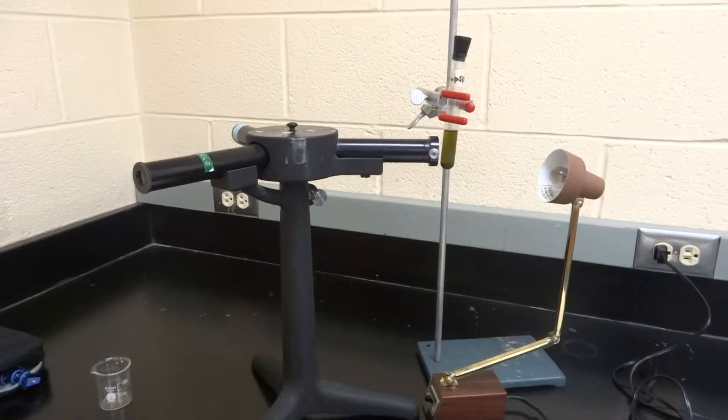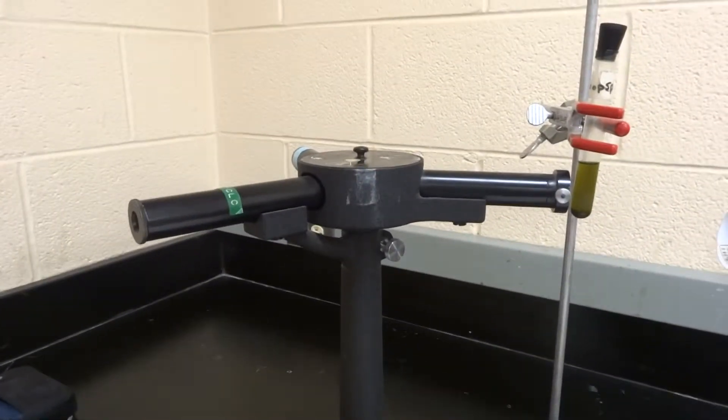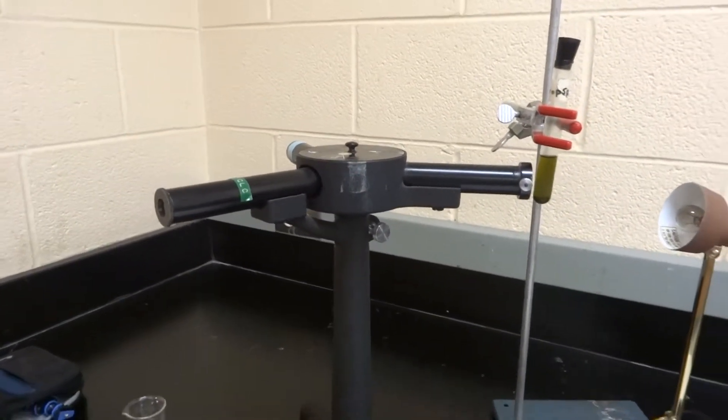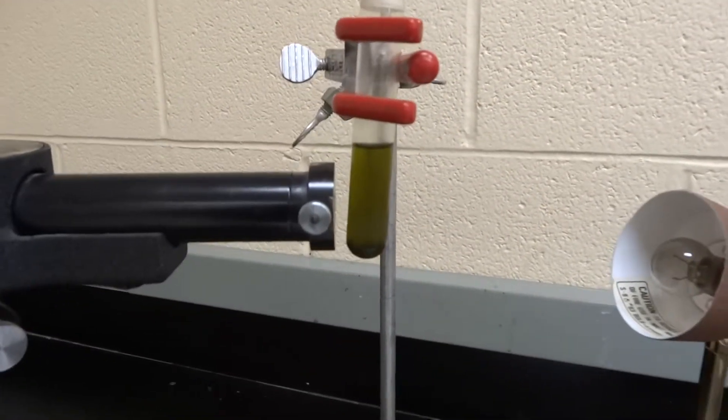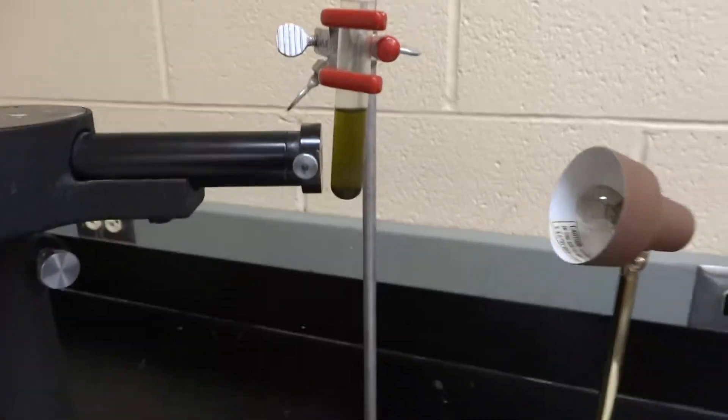Here we have the spectroscope itself which is this part here. What it has is a prism inside of it that's going to reflect light. I also have a spinach extract which is that green piece right there and a light.